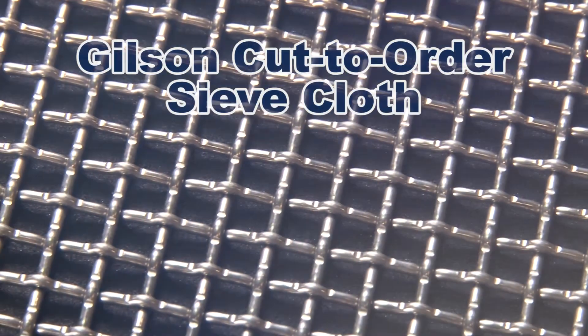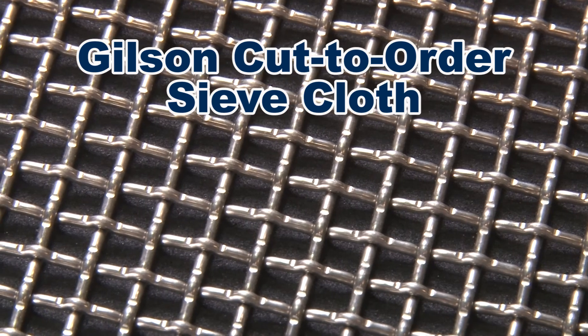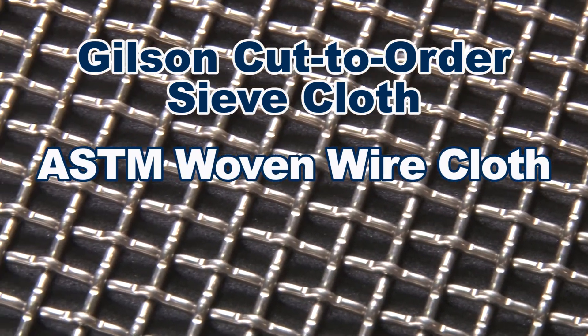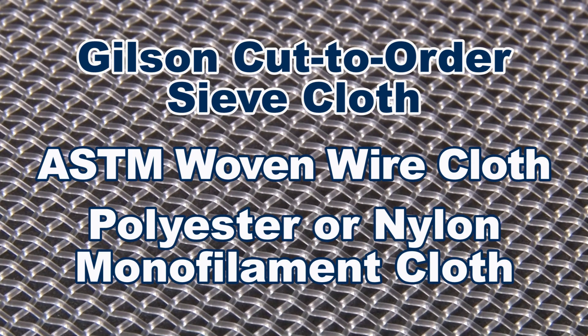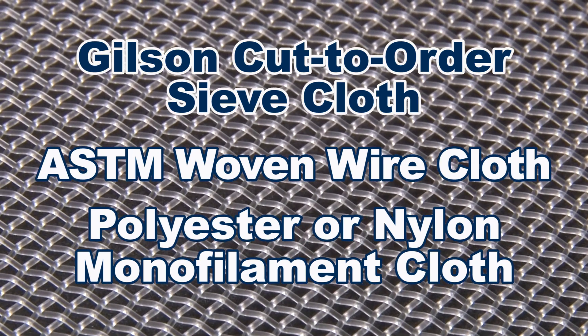Gilson offers a full range of woven cloth as either ASTM wire cloth or non-metallic polyester or nylon cloth, available for sizing applications where conventional test sieves will not work.